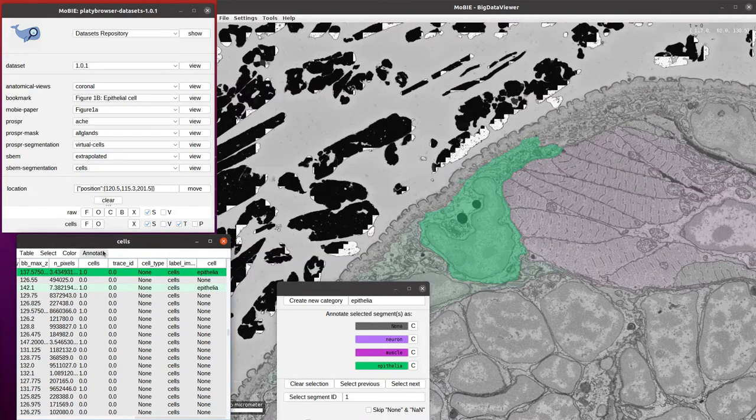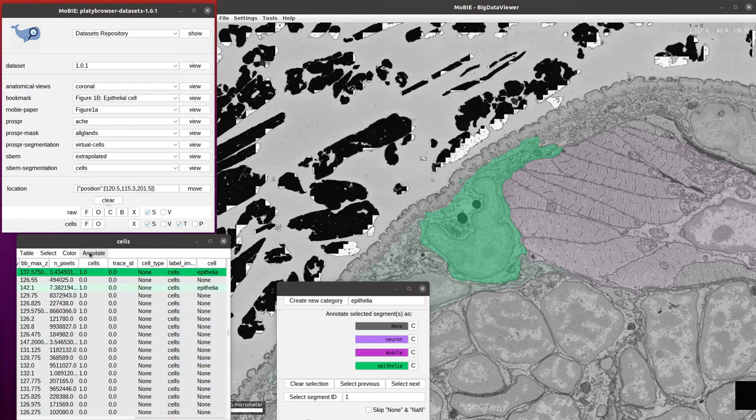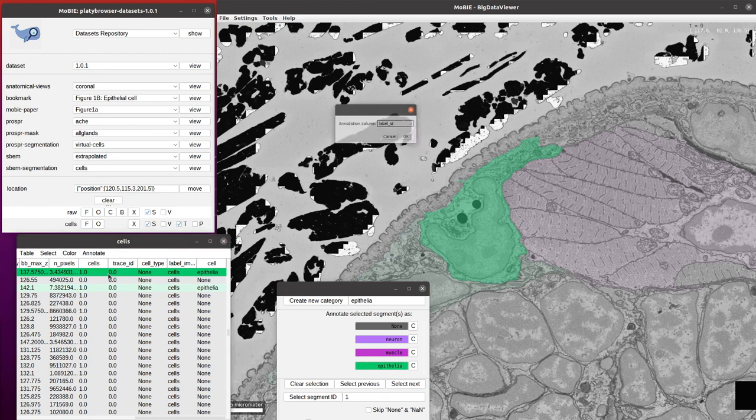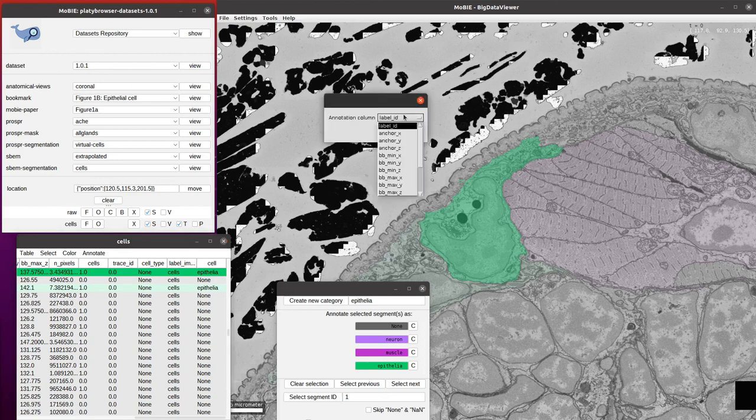Once you'd reloaded that column, if you then wanted to continue the annotation, you'll go back to the table, click annotate, and then continue annotation, and then find the column, in this case the cell column, and click OK.